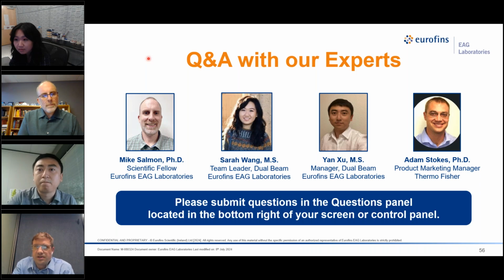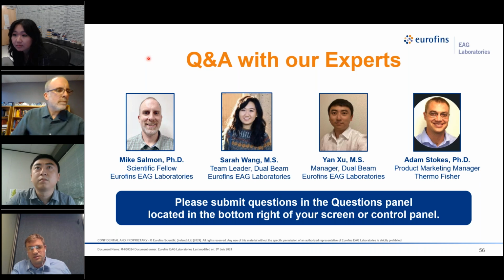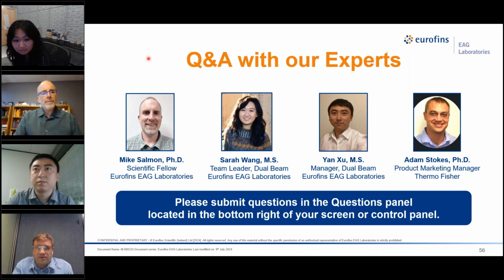Yeah, hi, thanks for the question. Yes, we've done a deep dive on this problem, and we've analyzed the differences between gallium and xenon. And now with hydro, we have the additions of argon, oxygen, and nitrogen. And we really are seeing some good benefits with argon. We're seeing it being able to cut dissimilar materials evenly, and the throughput is right there. So if you're having trouble milling through dissimilar materials and getting curtaining artifacts, first step would be using argon.